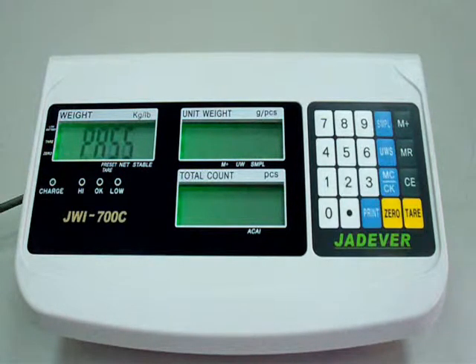The calibration procedure is completed with PASS appearing on the weighing mode. Now remove all the weights.